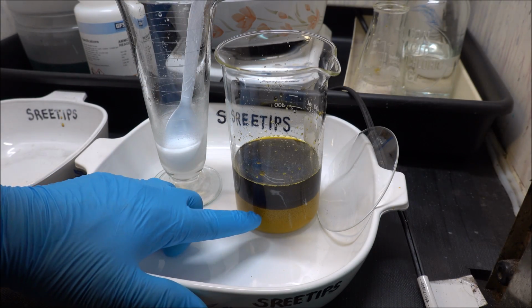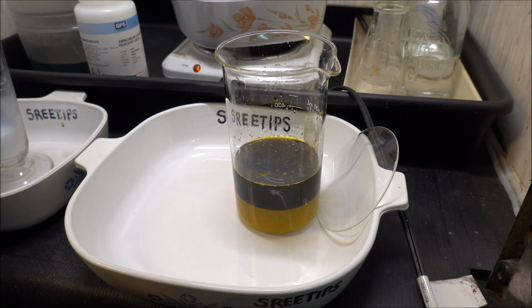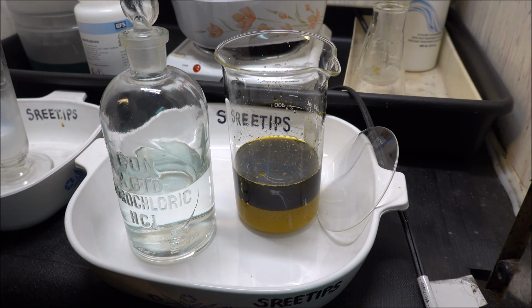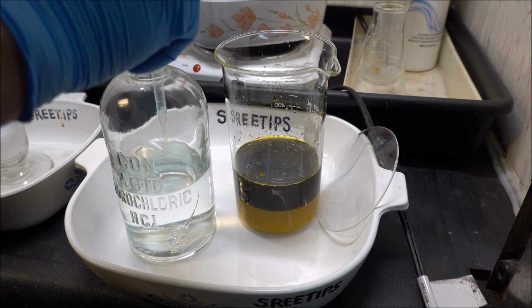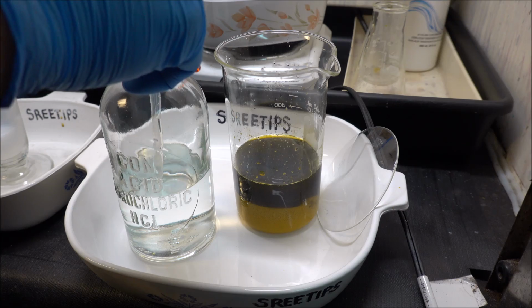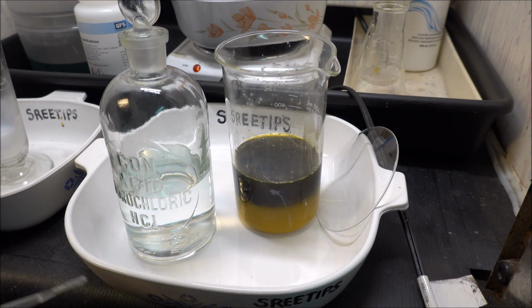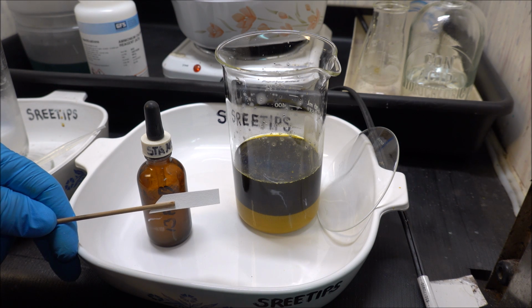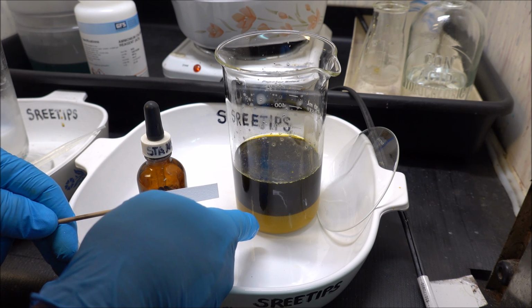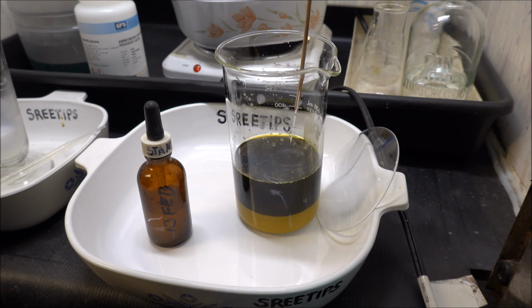Okay, as you can see, this is our ammonium hexachloroplatinate down here, platinum salt. It's fairly pure looking, yellow colored. What I'm going to do now is rinse down the sides of the beaker with some hydrochloric acid. Alright, here's my lack of experience shining through again. I think this is the platinum salt, the yellow colored material at the bottom of the beaker. Up here at the top, this dark colored liquid should be the remaining palladium in solution.